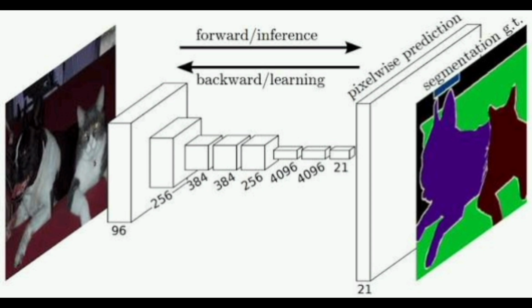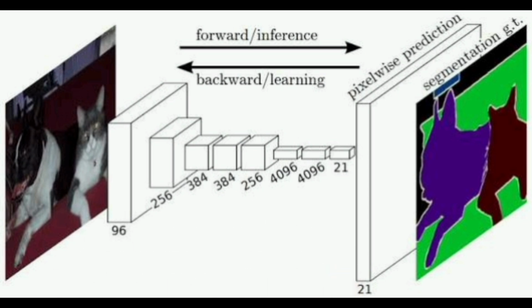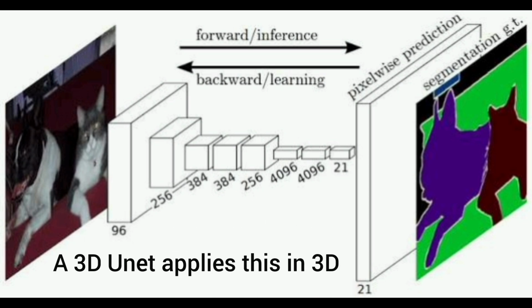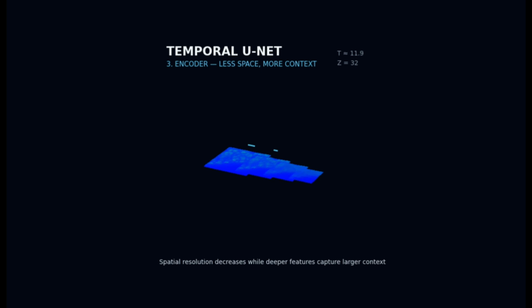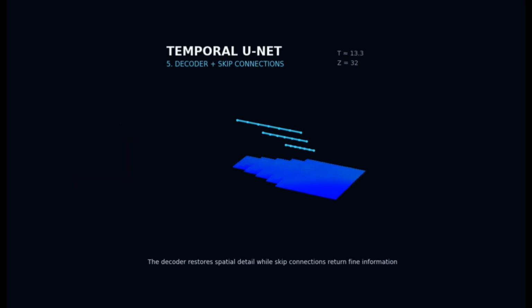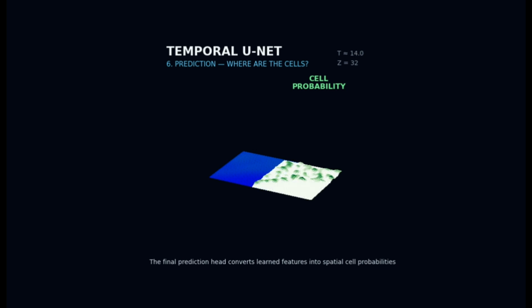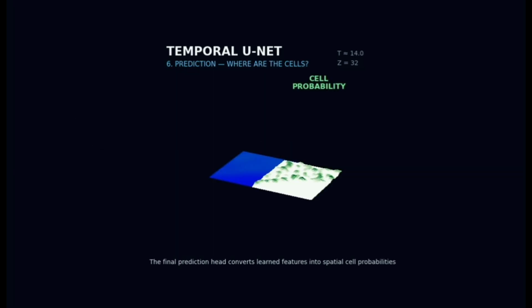Now the prepared frames go into the 3D temporal U-Net. But why a U-Net specifically? Well, we can use other things, but a U-Net doesn't just look at the local image details. It also builds a broad understanding of what the 3D surrounding structure is like. It uses three dimensional kernels to build a complex feature map, and that is one of the outputs that it produces. The second output is detection logits.